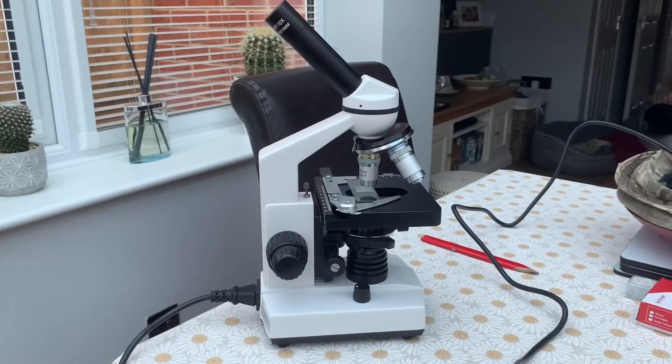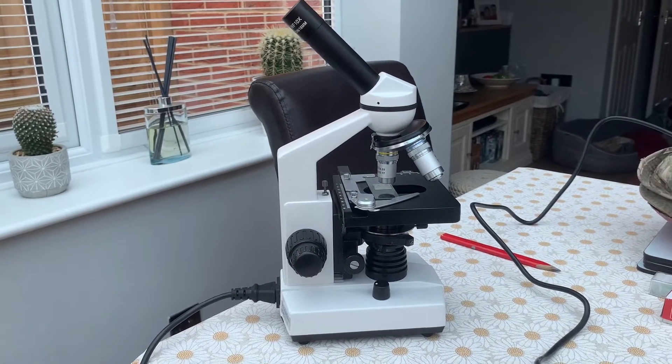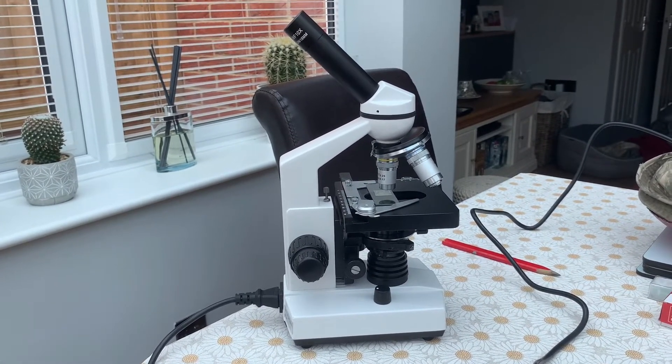For the koi hobbyist — whether serious or beginner — you're probably looking at around the £100 to £150, £180 mark at the most. I'll flip the camera around and show you what I'm using. This is the Apex Practitioner. I picked this up for just over a hundred pounds and it's more than capable of doing the job.